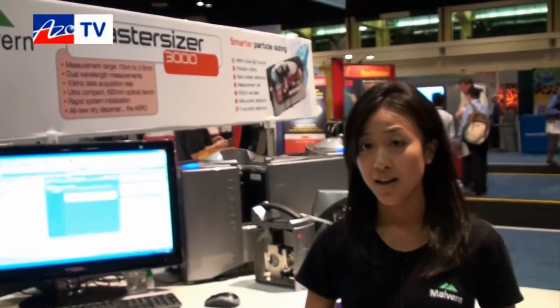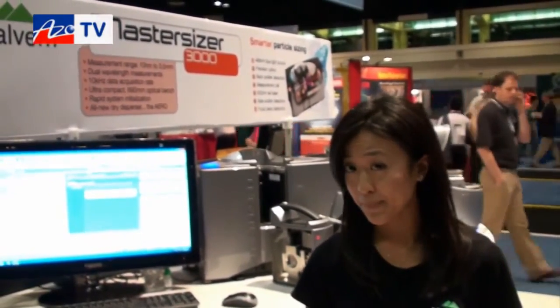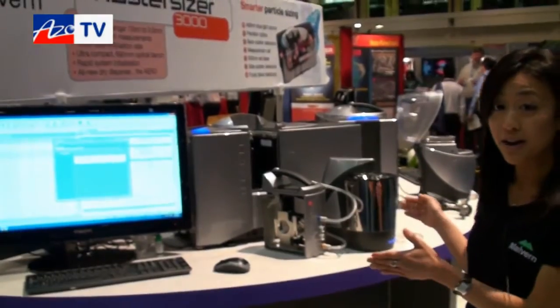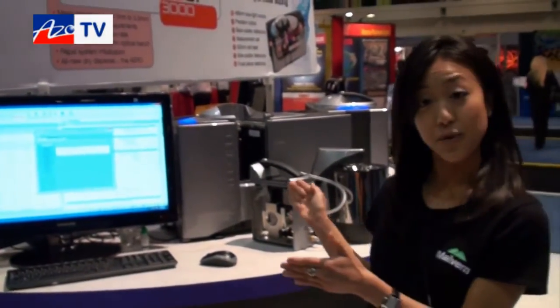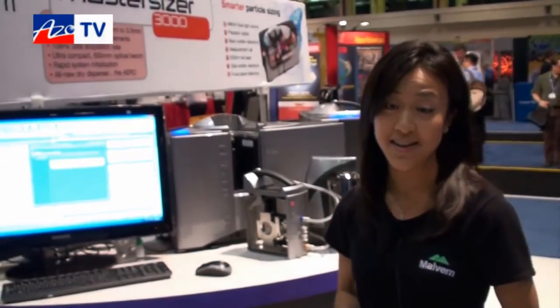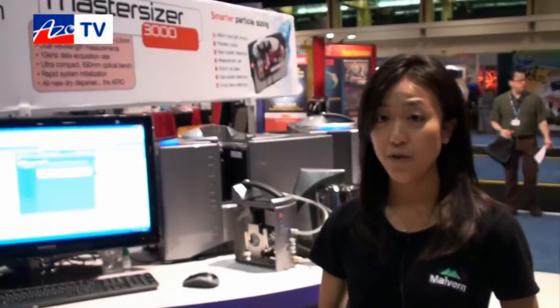What sort of sample size do you need? Very little — for dry samples, anywhere from milligrams to however many grams. What upgrades have been made on the MasterSizer 3000 compared to the 2000? As you can see, the footprint is a lot smaller — it's now only 29 inches long, so fitting it into a fume hood is also a possibility. We've also reduced the noise for our dry dispersion unit as well as the vacuum.